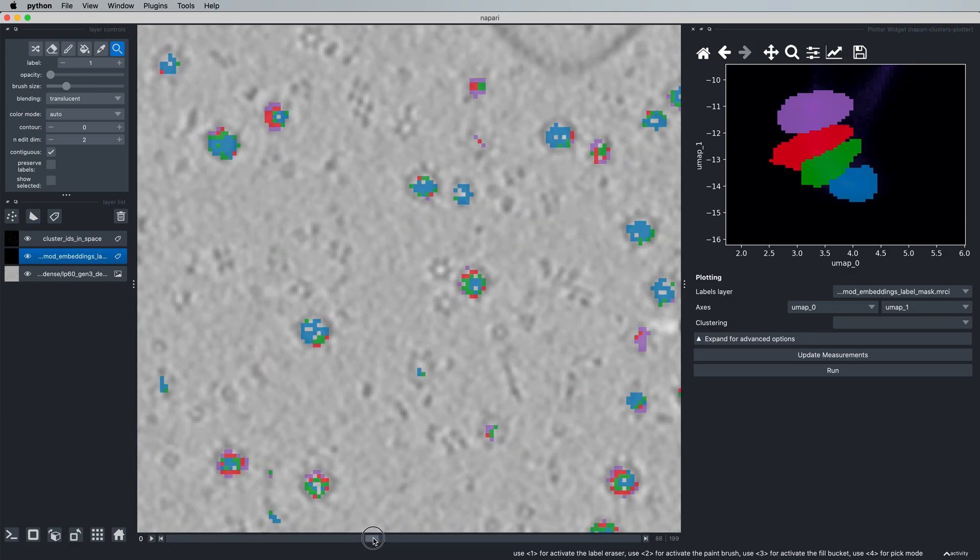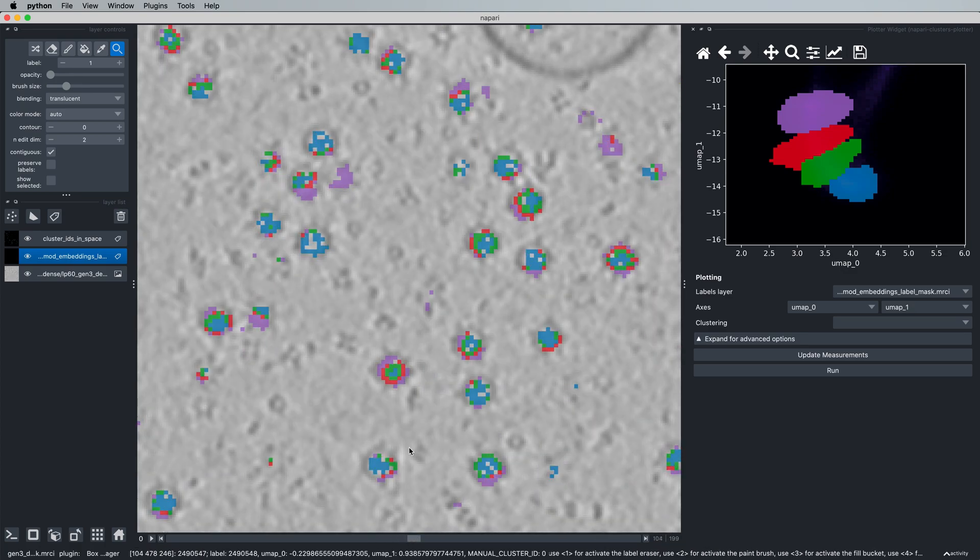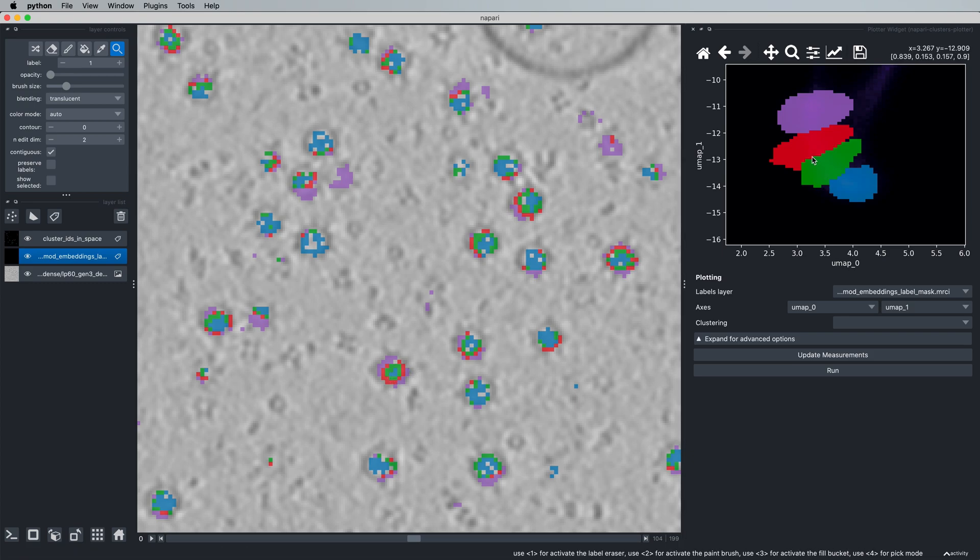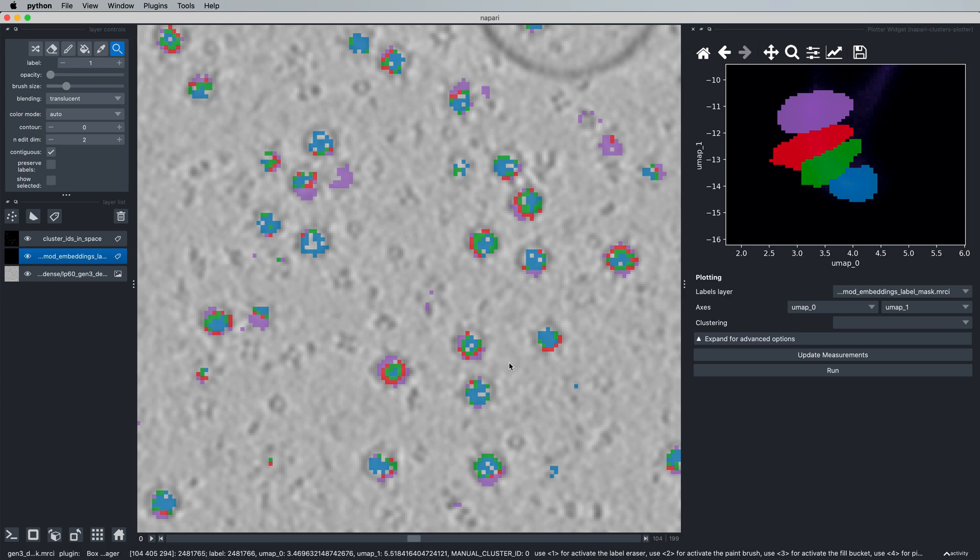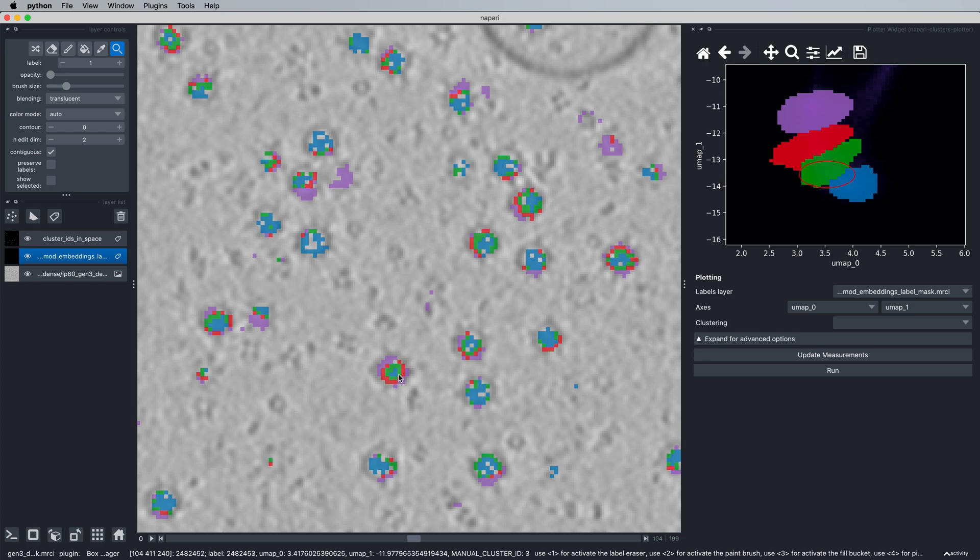So in this case, if we wanted to pick this protein, it would be better to pick the blue embeddings here rather than the green, red, or purple embeddings here. And the best way to do that is to simply click around in your tomogram and see where exactly those proteins of interest are.